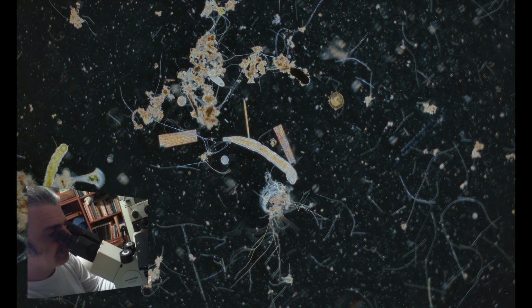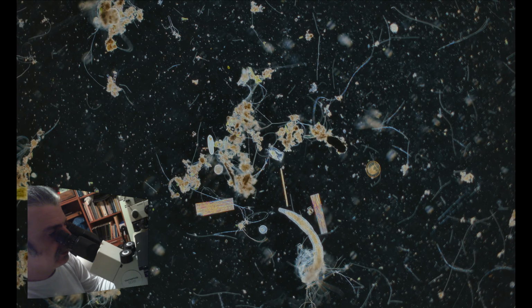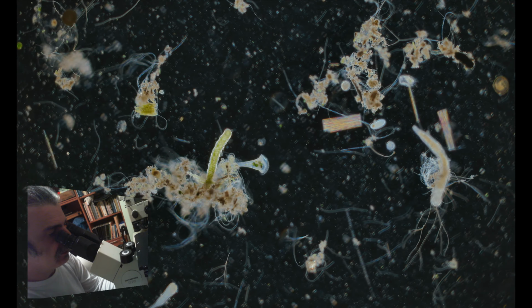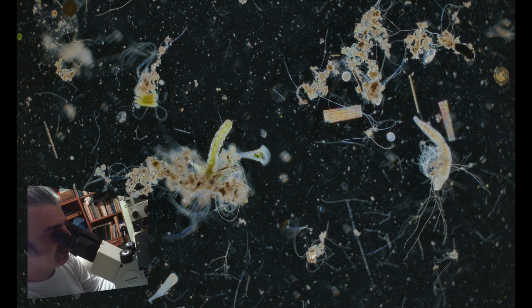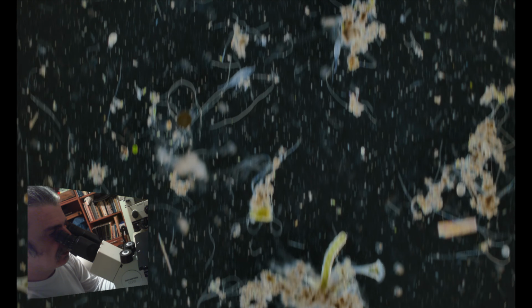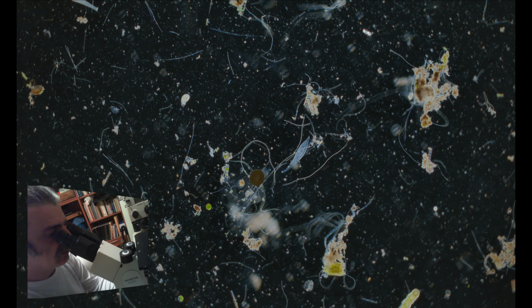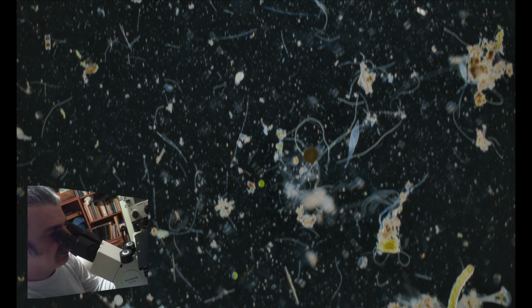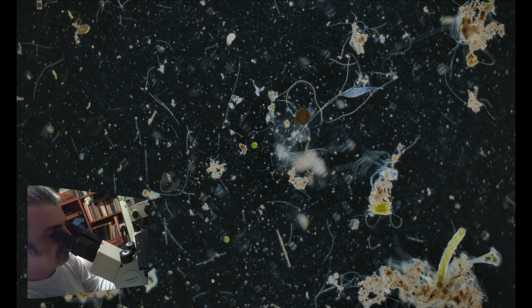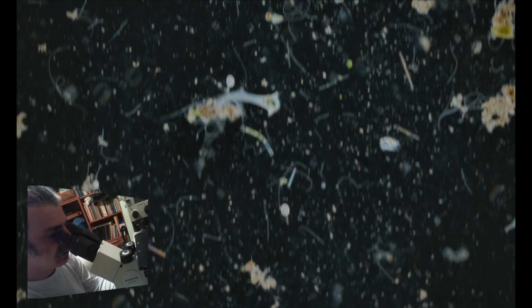The big one here is a worm. We can see another Euplotes here, and a frontonia. Here is another stentor from a different species. Here's another stentor, Lytonotus. This is a testate amoeba called Arcella. This one, I think it's Trachelomonas, an algae. We'll explore it later. Another stentor.